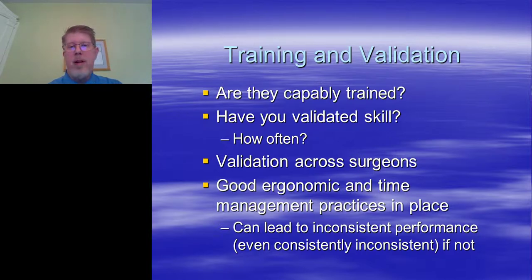I'm not going to brush briefly over training, but the people doing your study and doing your surgeries, are they trained? Have you validated that they're doing it properly? And when was the last time you validated? Surgeons drift. We change our technique over time, either because we've learned things or we've modified our technique because it's easier, more straightforward, or what have you. But it can mean that we're not doing surgery the same way that we were when we validated on the model. And maybe that won't make a difference, but maybe it will, and it's important to know that.